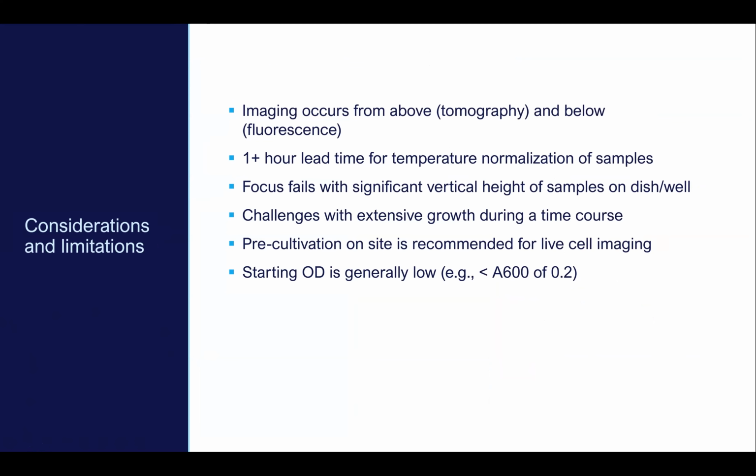You also have a 1-hour lead time that is required as the sample sits on the instrument, because the temperature of both the media and the cells have to come to an equilibrium in order to not have changes in focus during the acquisition.